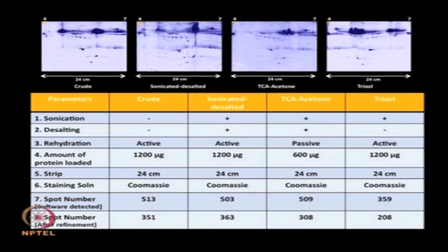I am trying to give you all the details of what one needs to perform before reaching the stage where you can compare the healthy controls with the clinical samples. This lecture is trying to cover various concepts which we have talked about in sample processing and in different lectures of two-dimensional electrophoresis.